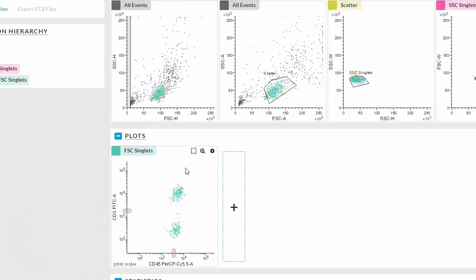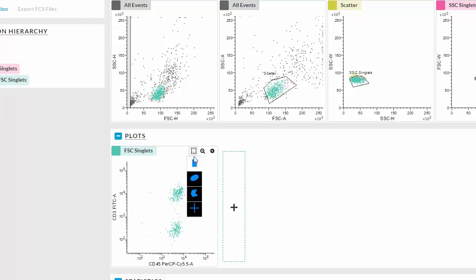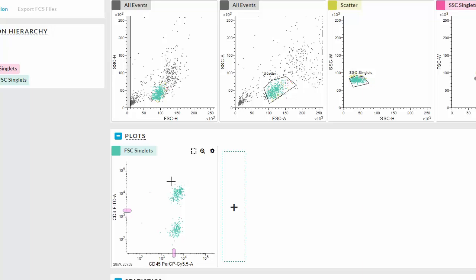To create a new gate, click the square icon with the dotted line. Select a shape and then draw on the plot.